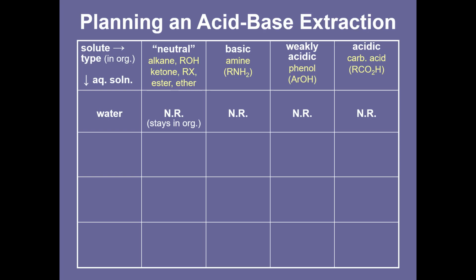Other solutions that can be used for an extraction include aqueous acid, such as 10% HCl, strongly basic water, such as 10% NaOH, and mildly basic water, such as saturated sodium bicarbonate solution. Now let's look at each type of compound and decide how they would interact with the various aqueous layers.